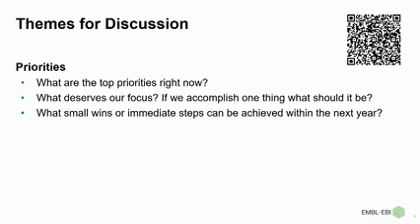Yeah, I think I can answer a bit to that. So within Elixir, the European bioinformatics infrastructure that Elliott mentioned, we currently have an implementation study running that also Thomas is included in. And one part of the work package is actually to look at current reporting standards for chromatography, if there are any, and to revise and also define what we want to actually report there to make it reproducible and reusable for others.